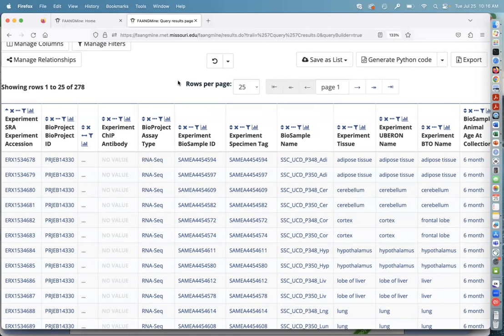Depending on how these samples were submitted to the biosample database, sometimes the biosamples were submitted as the tissue sample, and sometimes they are submitted as more related to the library. So there'd be different biosamples submitted for different kinds of experiments.